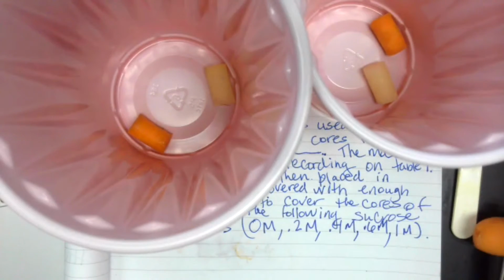And then I'm going to go ahead and just go get my solutions real quick. Sorry, I should pause, but it doesn't let me do anything then. Oops. Solutions already in the back of the room. 0 molar, 0.2 molar. Oh, see, I already forgot. Good thing I didn't pour the sucrose yet, although it wouldn't have been enough to really matter.